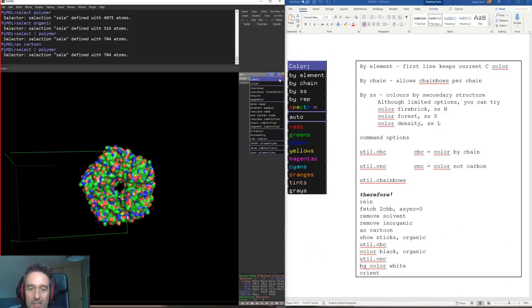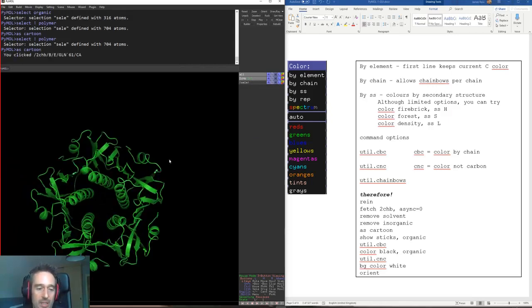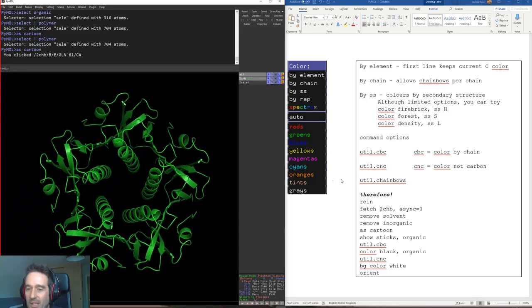And the labellings, PyMOL has a way of labelling things, but to be honest, if you're going to label anything, don't label it inside PyMOL, label it inside PowerPoint or Inkscape or whatever your favourite image manipulation program is, because the labels in PyMOL are a bit particular. So we'll just move straight on to the colouring here. Let's go back to as cartoon. Okay, so it kind of defaults, comes in as this kind of green. Let's have a look. So, and let's say as sticks actually.